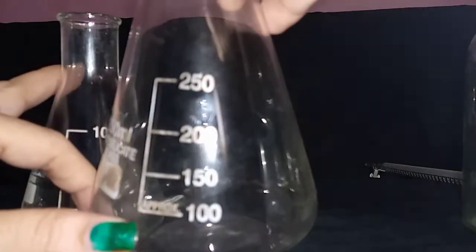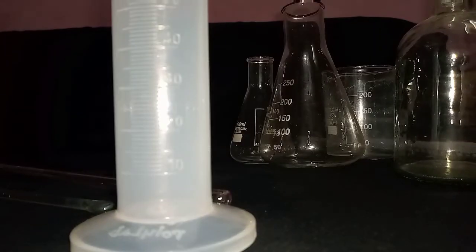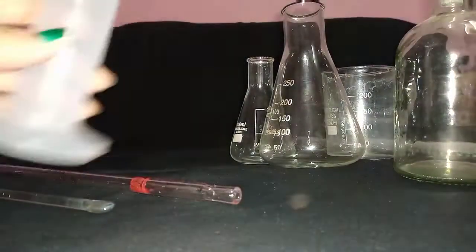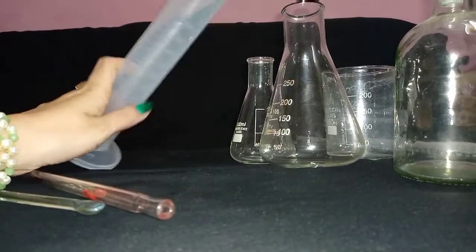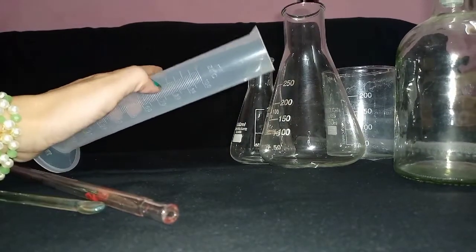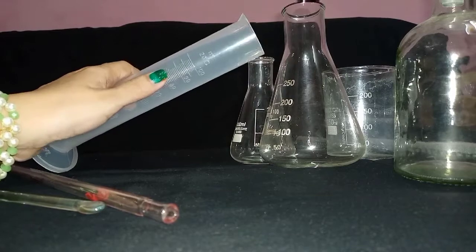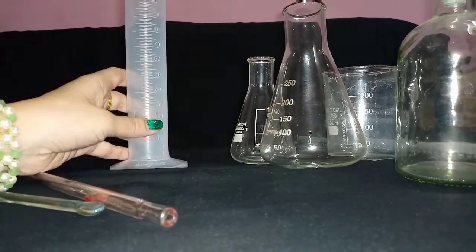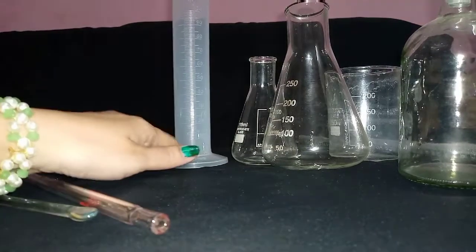These flasks come in different sizes: 50 ml, 100 ml, or here you can see 250 ml. This is a measuring cylinder. They are graduated slender glass cylinders used for accurate measurement of liquids. They come in measures ranging from 5 ml to 100 ml. This one here is a 100 ml graduated cylinder—you can see 100 ml, 90 ml, 80 ml, these are all exact markings. This is a plastic one, but usually we use glass ones.